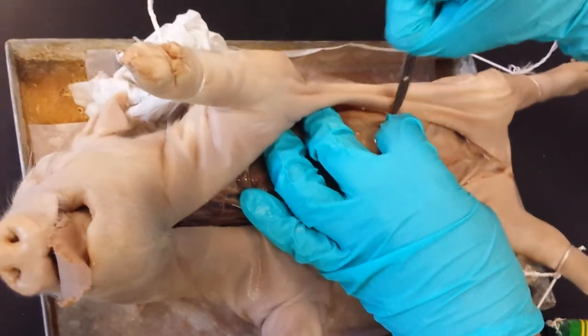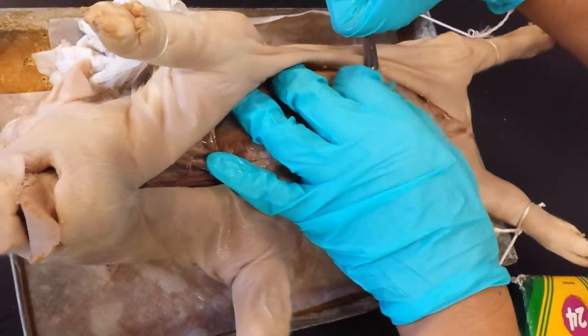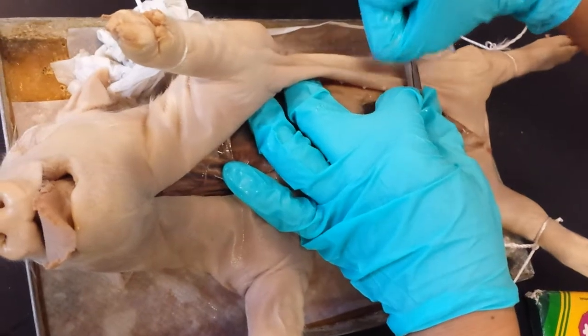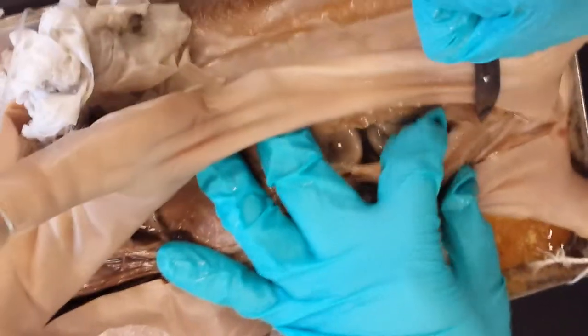Y'all should like cut it open for labeling. Yeah. Wait, I think I found the separation. You see it? I think I can. It's gonna start getting hella juicy once you cut the. Oh, it got juicy, alright. That sounds like a really bad Starburst commercial. Someone gotta like dab it with a napkin. There we go. Right lung. There you go.